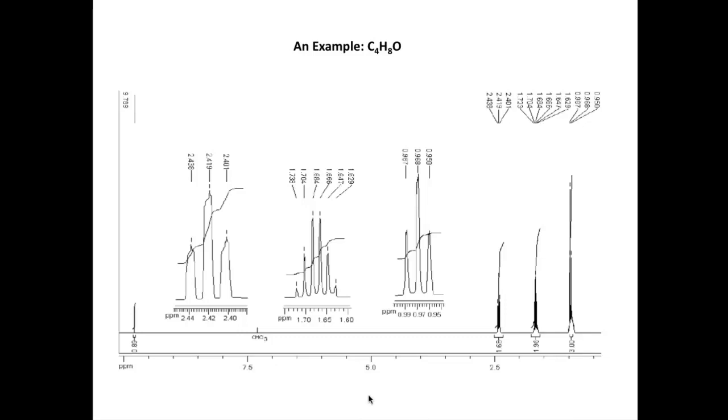And it's worth pointing out that this signal here, this very small signal, is due to chloroform, CHCl3. And it's a residual amount of the chloroform, which is present in the deuterated solvent, which is deuterated chloroform, CDCl3. So let's now look at applying our four steps to assigning this spectrum.